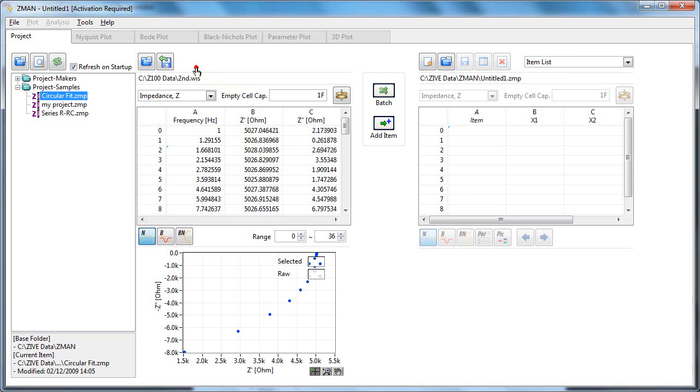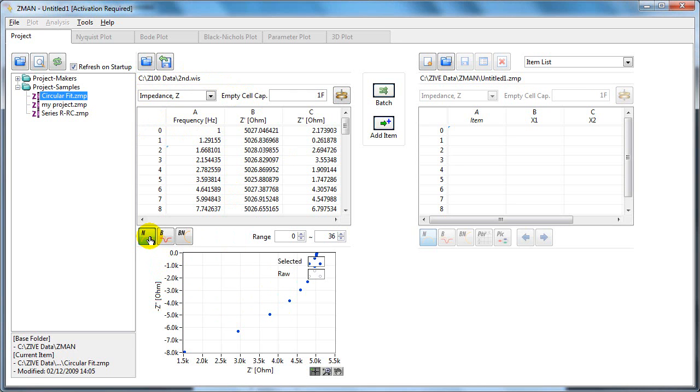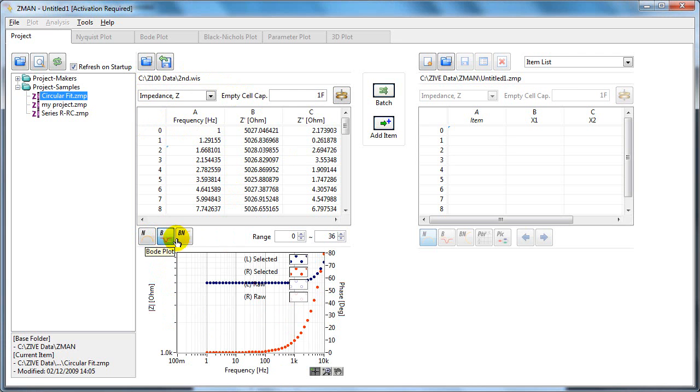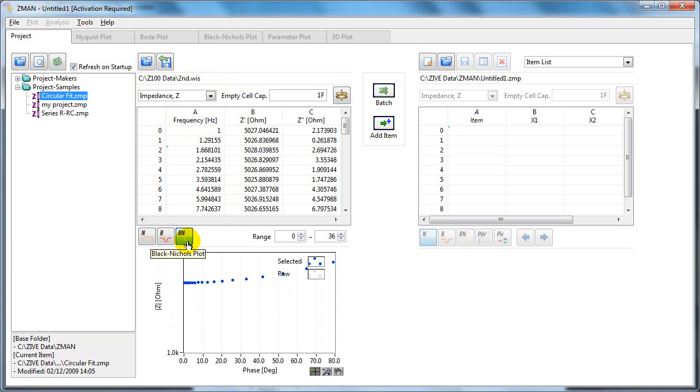If you've opened your data in the preview section, your data will be listed in the table and in the plot here. There's various plots you can look at, for example the Nyquist plot, the Bode plot, or the Black Nichols plot.